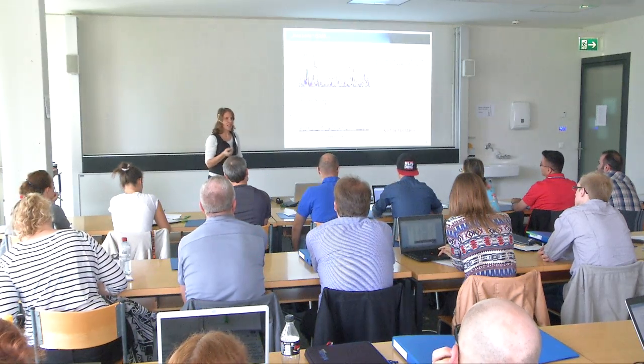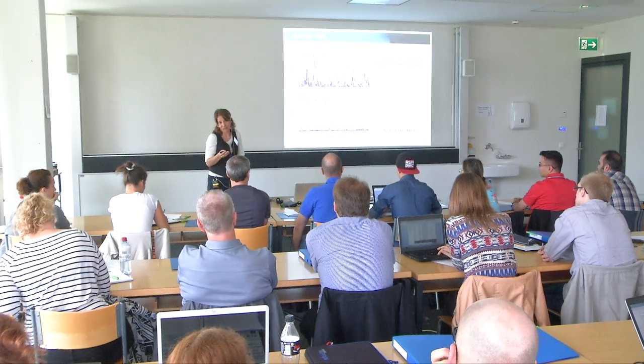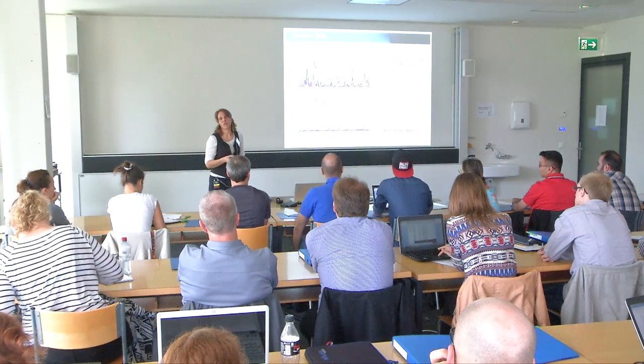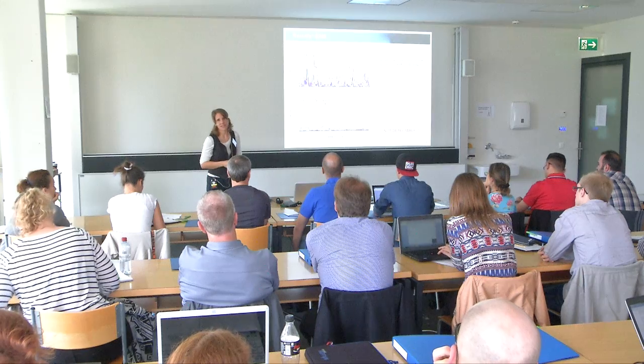So usually when I do my manual analysis in Skyline, I would never do this, and I just look at the chromatograms, I go through them, and I decide based on this. But yeah, for a global analysis, this is definitely something to consider and to think about.